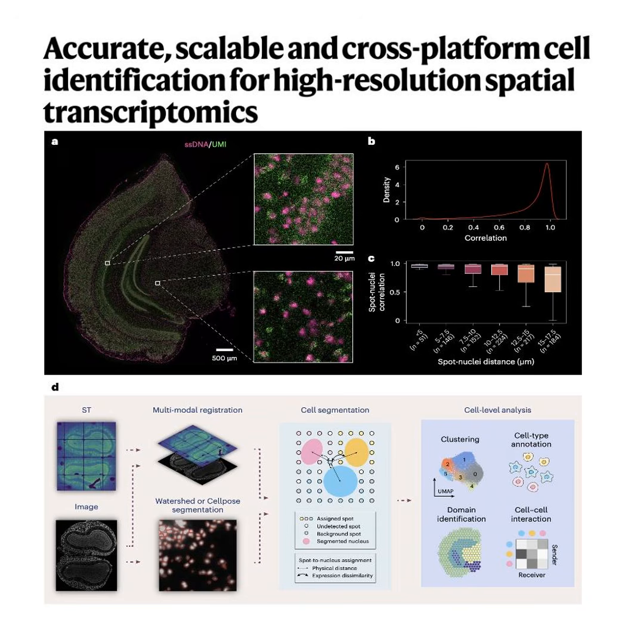Yes. So look at patient ST1. Their boundary was packed with 2 types of macrophages, CXCL9 positive and SPP1 positive. Now, CXCL9 positive makes the tumor hot, right? It brings in the heavy-duty cytotoxic T cells. It does. But the SPP1 positive macrophages were physically right alongside them, acting as a chemical wall. They were literally excluding the T cells from actually entering the tumor core. So the troops arrived at the border, but the bouncers wouldn't let them in.